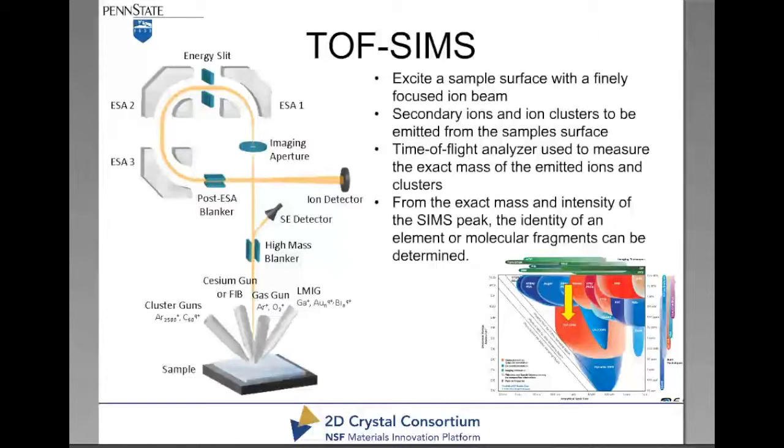So we said, okay, well, we obviously have to clean up our act, right? The dimethyl selenium, even though it claims proudly that it's 99.99% pure, well, a whole bunch of that 0.01% is the rest of this stuff here in these bars, right? So it's a lot of stuff, even if you can't see it so well. You move to hydrogen selenide. Again, the hydrogen selenide actually is not quite as pure as it should be, but I think it's about 99.5% in this particular case. So there's still 0.5% impurities in this hydrogen selenide.